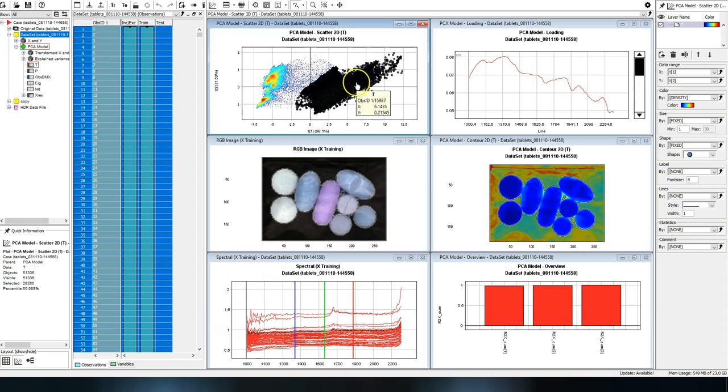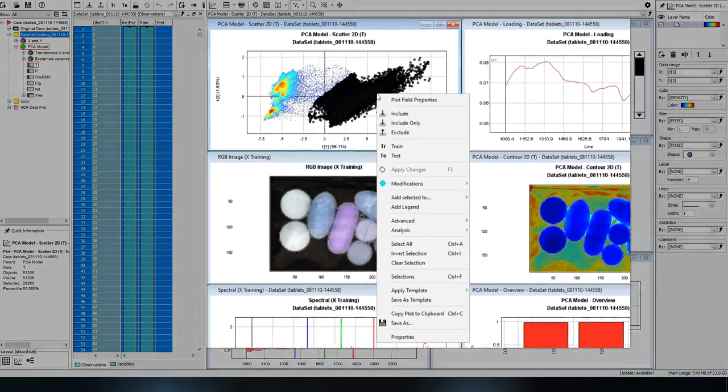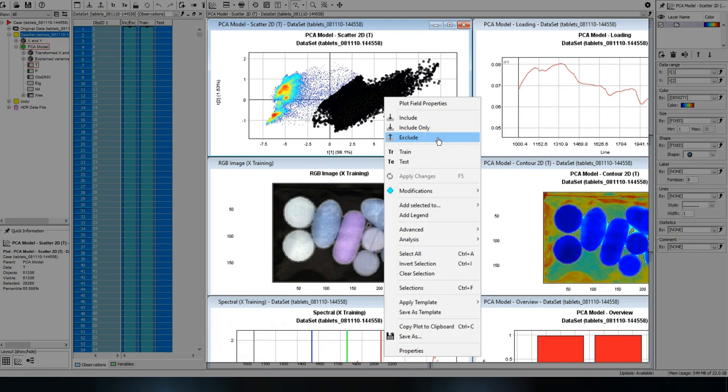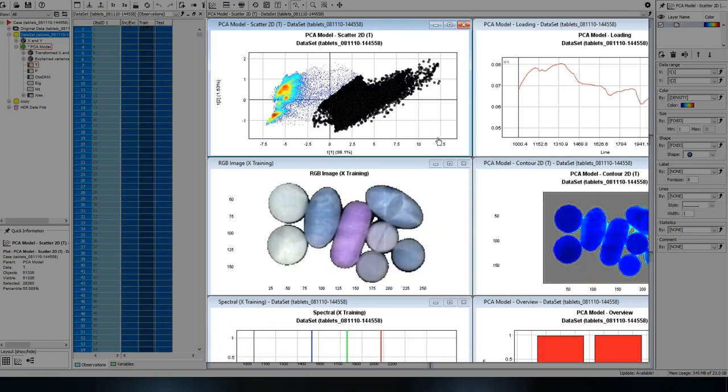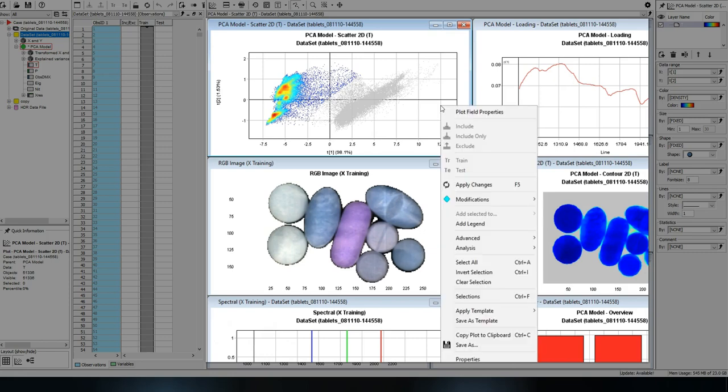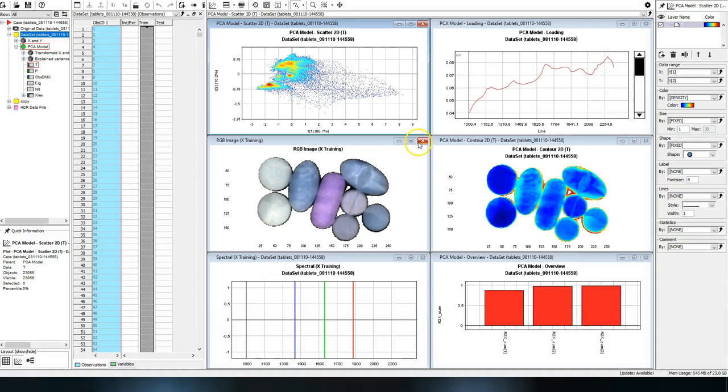By right clicking on a plot, you can access a menu to make modifications to your dataset, for example to exclude the selections I just made. After applying the changes I just made, the data and the connected models will be automatically updated.